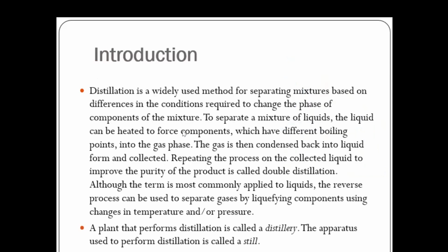First of all, in the introduction: what is distillation, what is the meaning of distillation? It is a widely used method for separating mixtures. Any liquid containing different types of components can be separated into individual components. It is based on differences in the conditions required to change the phases of the components of the mixture.